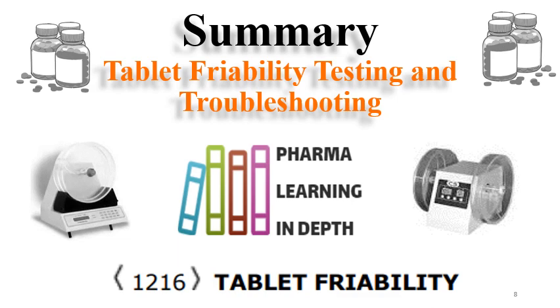Different formulations require different strategies for getting the friability in range. Sometimes the packaging is required to be improved. Generally for chewable tablets, the friability testing becomes very critical as these are bigger size tablets, and also for chewable tablets the hardness range is very important. So always try to understand the effect of composition, effect of manufacturing process and hardness on the friability.